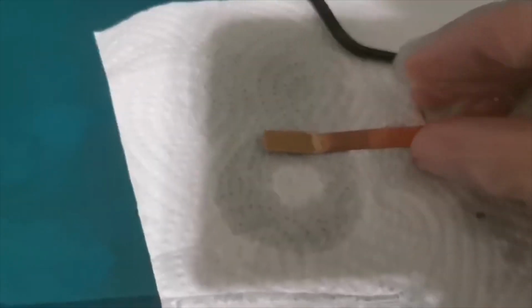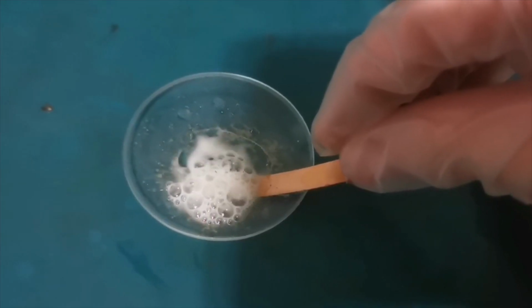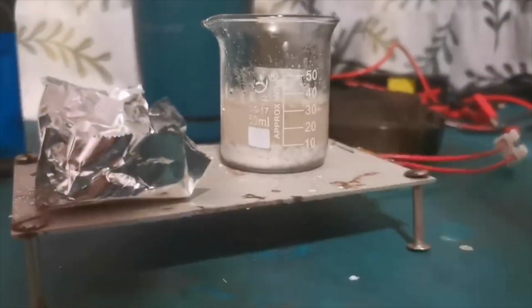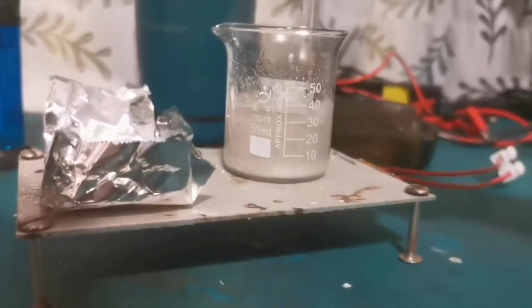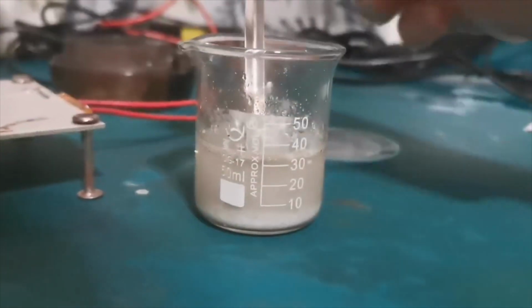When I came back to the lithium I produced, it had reacted with the air to form a yellowish layer of oxides. I put it in some water and it produced some large bubbles. From this point on, I'll stop testing things around and throwing lithium in water and actually collect my lithium metal produced. I cleaned my copper cathode and weighed it. The cathode weighed 0.5 grams, and after this run, I'll weigh it again to find how much lithium I produced.